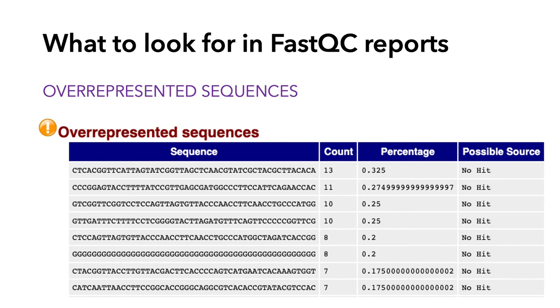Over-represented sequences can be produced by highly expressed transcripts and may trigger a warning in this module. But it's also where things like contaminants and primer sequences can show up, so you're going to want to check any unknown sequences against BLAST. The last column in the module identifies possible sources — sometimes it'll say things like universal Illumina primer or adapter sequence. If it says no hit, you'll have to figure out what it is and make sure it's nothing problematic.